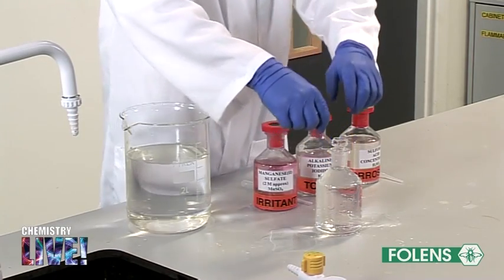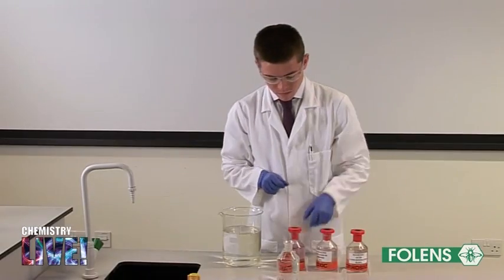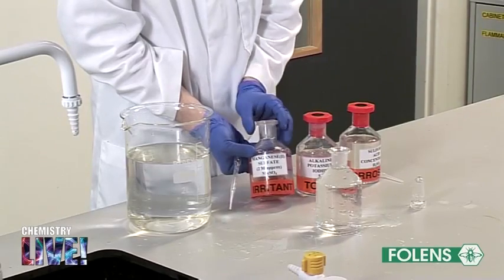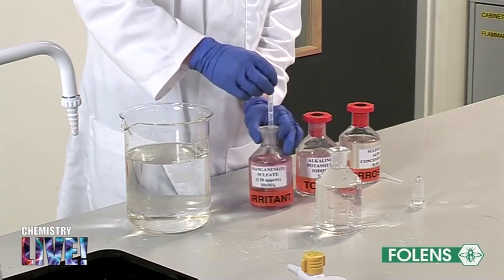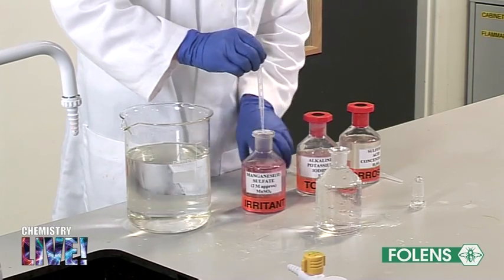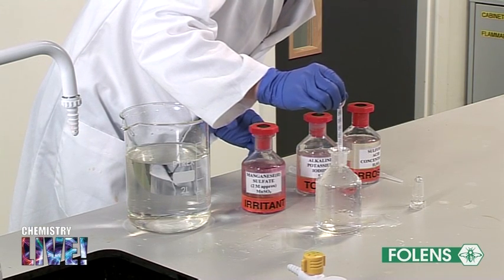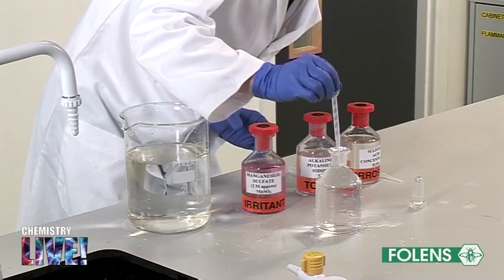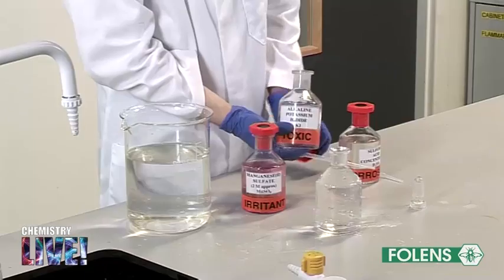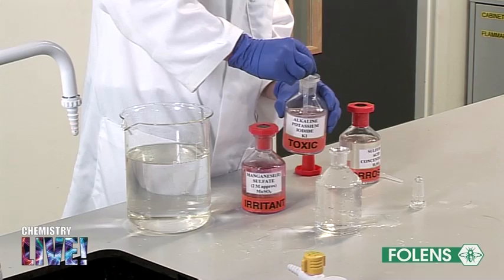Remove the stopper from the bottle. Then using a graduated dropper, insert the end of the dropper under the surface of the water and add one centimeter cubed of the manganese sulfate solution. Using another graduated dropper, insert the end of the dropper under the surface of the water and add one centimeter cubed of the alkaline potassium iodide solution.